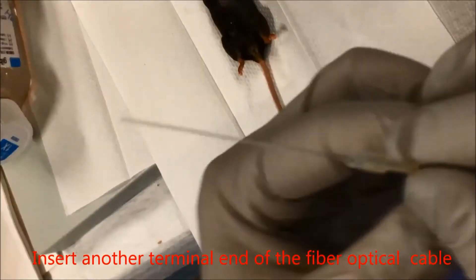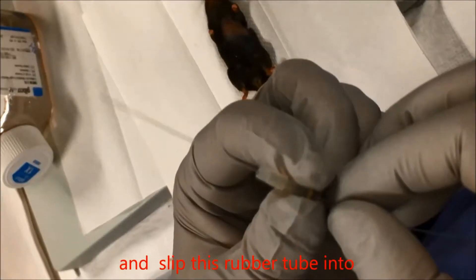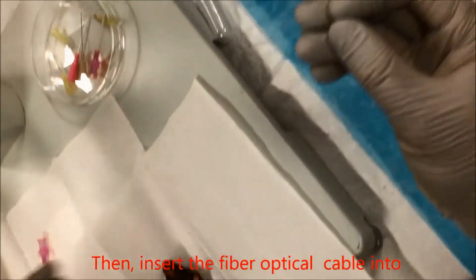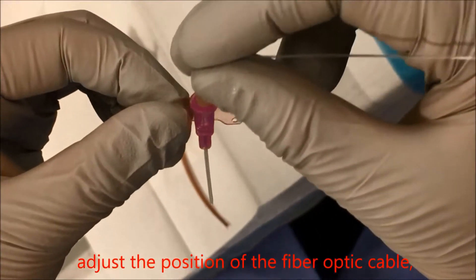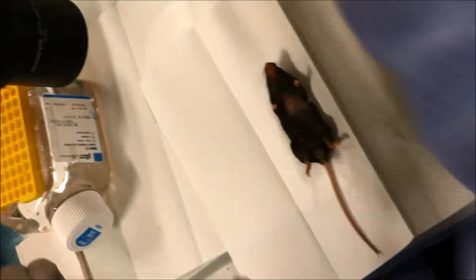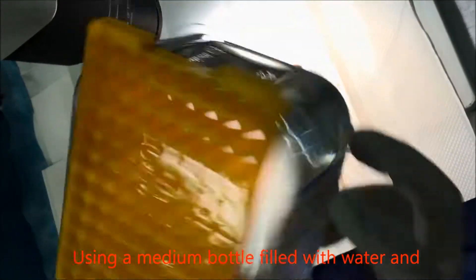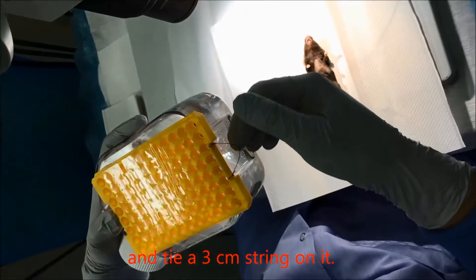Insert the other terminal end of the fiber optical cable into another rubber tube with 0.7 millimeter inner diameter, and slip this rubber tube into a piece approximately 4 millimeters in length with 3 millimeter outer diameter and 1 millimeter inner diameter. Then insert the fiber optical cable into a 20-gauge catheter. Adjust the position of the fiber optic cable so it extends through the cannula around 2 millimeters in front of the cannula tip. Connect the centrifuge tube terminal with one gooseneck of a fiber optic illuminator. Using a medium bottle filled with water fixed to a pipette tip box, make a mouse holding support stand and tie a 3 centimeter string on it.